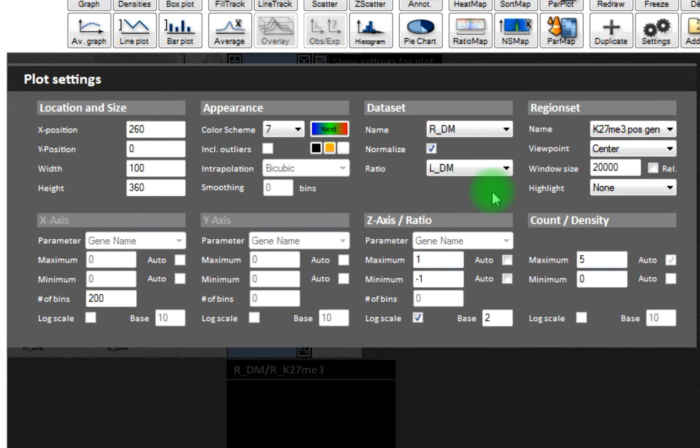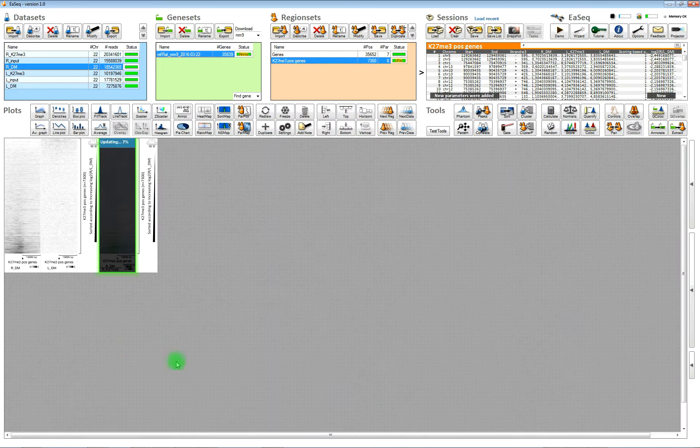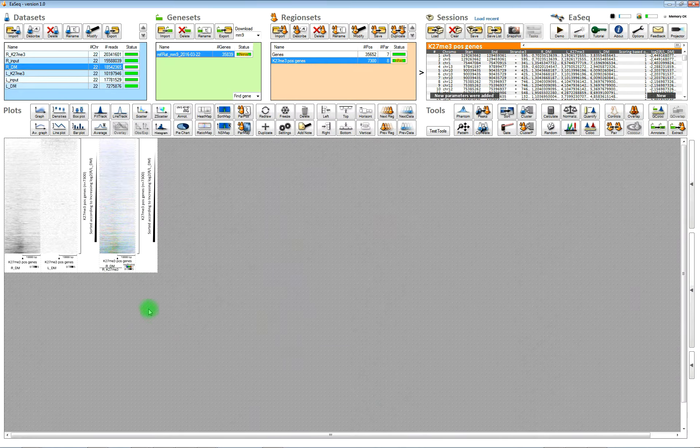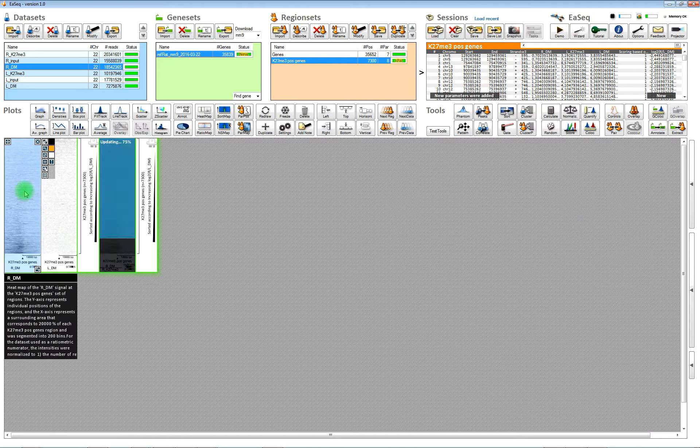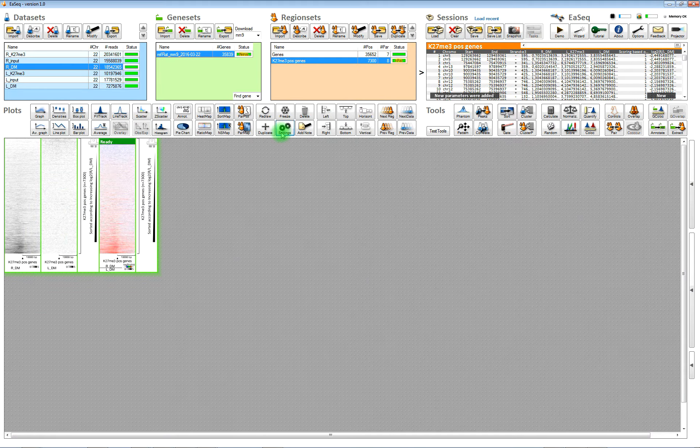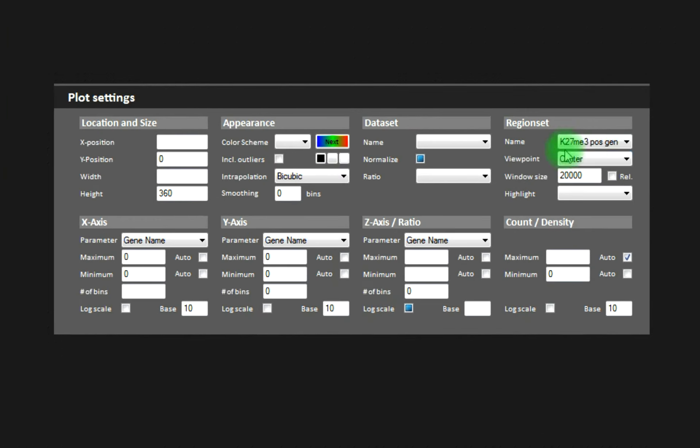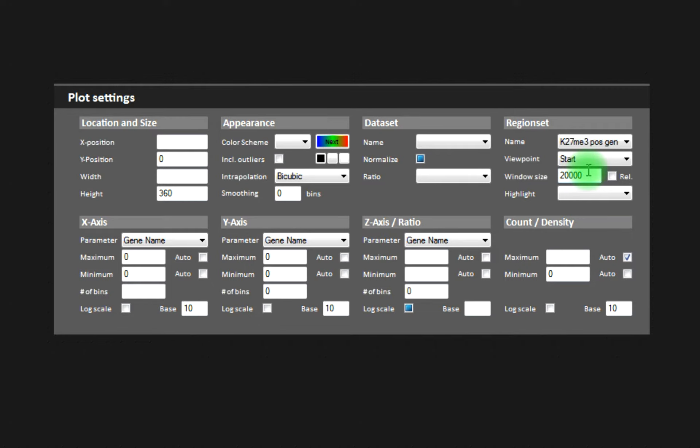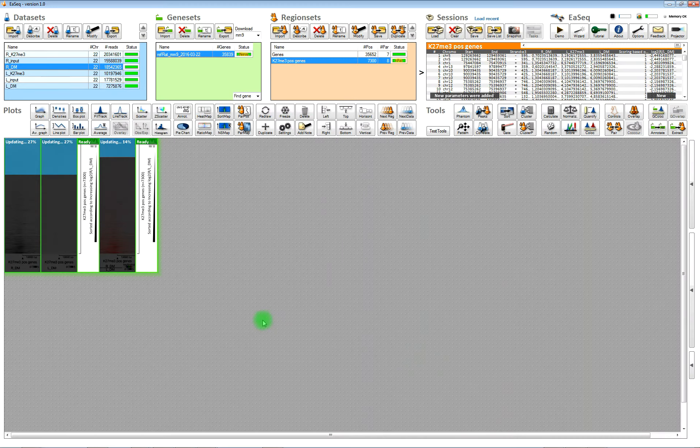You have to choose what it normalizes to here. And then we also need to change the settings for all the heat maps because the heat maps will by default display the center of the regions, and we need it to display the start. That's the transcription start sites.